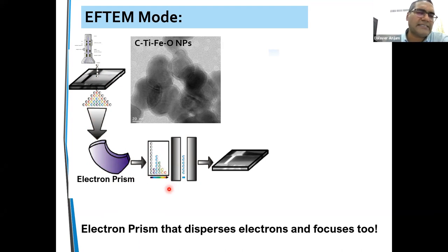So you can imagine now, if the electrons lose energy from carbon, they will lose, let's say, the K orbital energy, 284 eV, or if they lose energy from oxygen, again the K orbital, that will be 532 eV. So you can see that carbon will appear here and in the red place will appear oxygen. If we can separate them, we can make an image coming from only carbon or only oxygen, and that's exactly what is done. It's a very expensive technology, but possible.